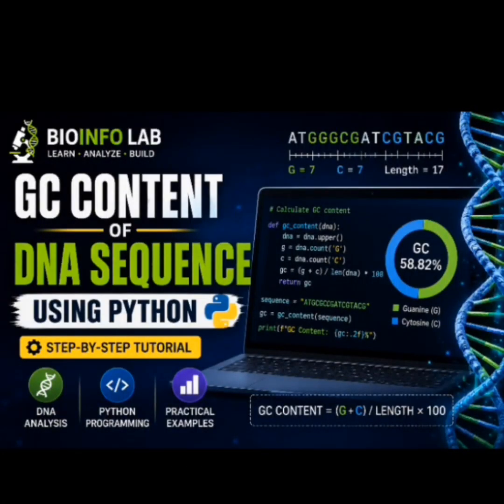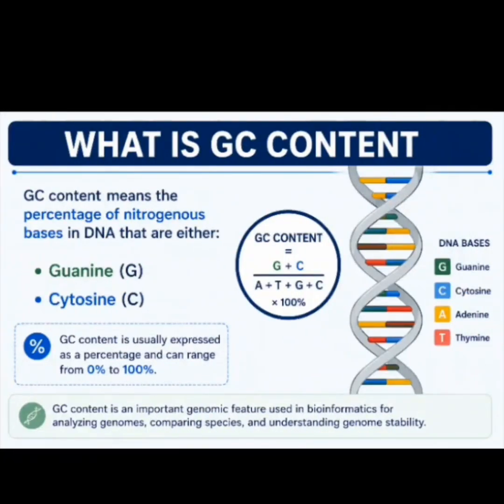In this video, I will show you how to calculate the GC content of a DNA sequence using Python. This is one of the most basic and important concepts in bioinformatics. I know someone may ask, what is GC content? GC content means the percentage of nitrogenous bases in DNA that are either guanine or cytosine.